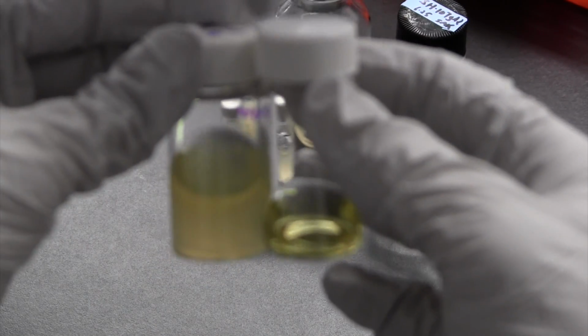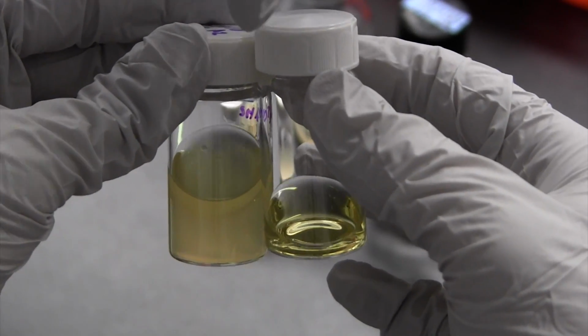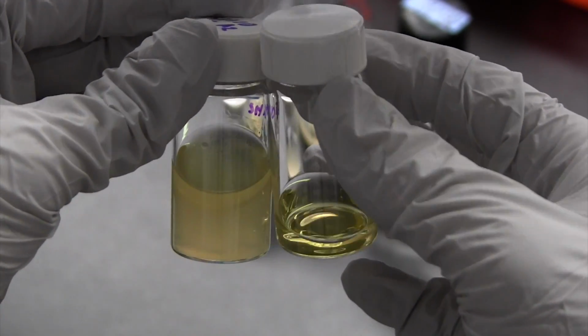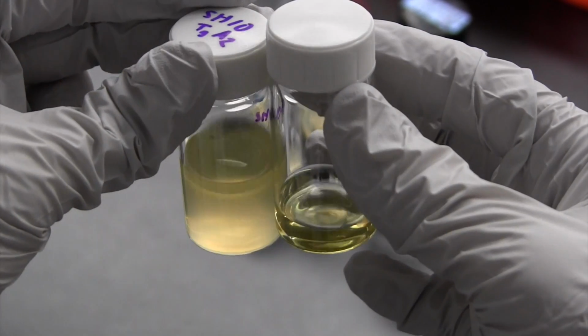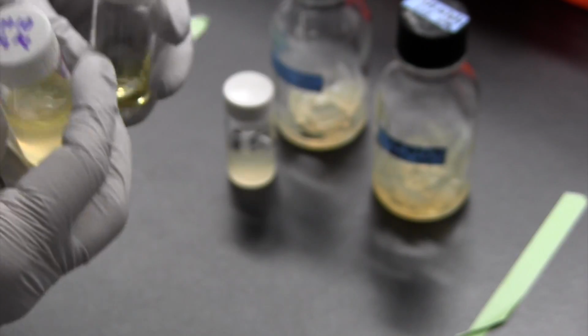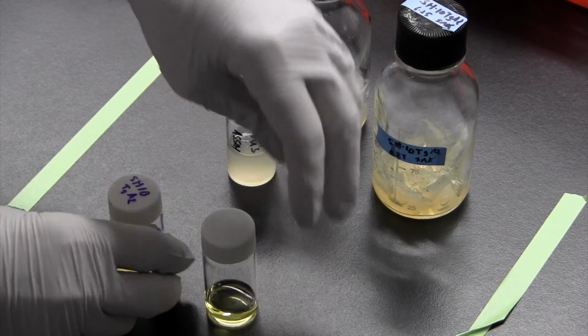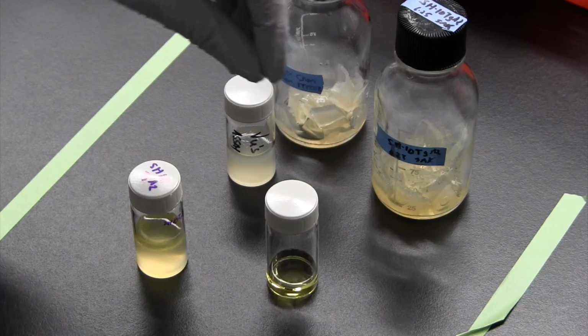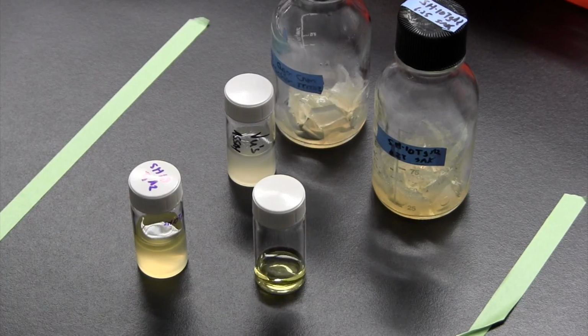from this point forward. And the very next step that would happen at this point is you would actually make sure your vials are labeled on the side as well as the lid, and these vials would get placed in the hood and dried down. One of the great things about ethyl acetate is that within 2 hours, but definitely overnight, your sample will be completely dried down in this scintillation vial, and you'll be ready to move on to step 4.